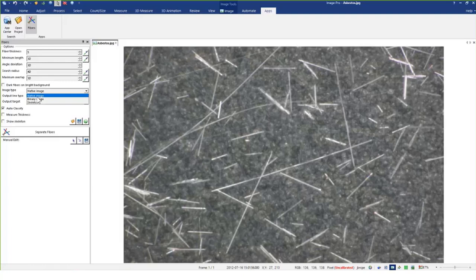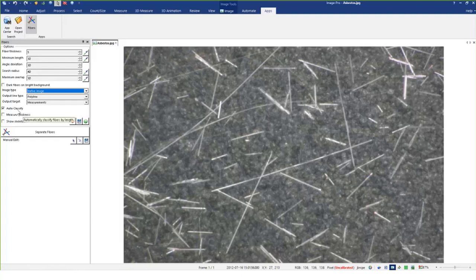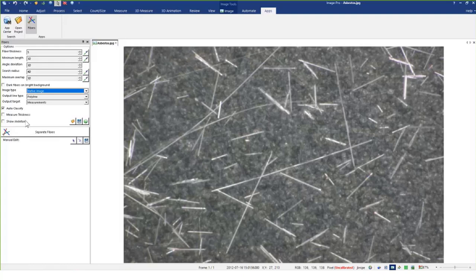If you go through and make a binary mask you can also skeletonize it, but the app will typically do that itself. Typically I'm using either the native image or, in difficult cases, a binary mask. For data outputs, there's auto classify, a length-order sort, thickness measurement, and the option to show the skeleton over the image. What's occurring underneath is that ImagePro runs an edge detection filter — specifically a Sobel filter — to detect the fibers. That's an important point I'll come back to.